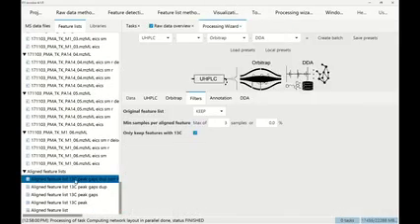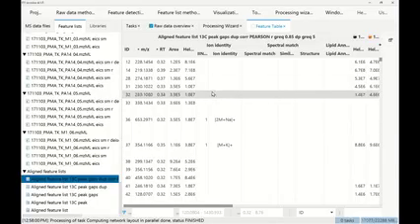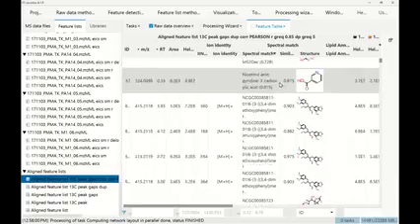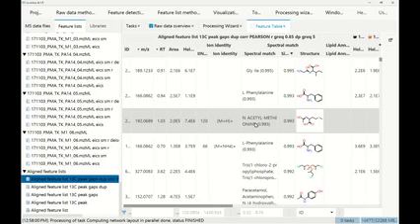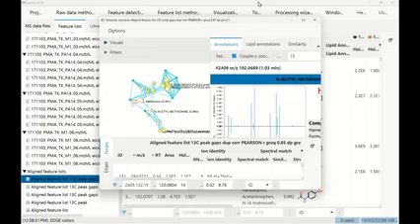I double-clicked on the feature list with the longest name. Then in here, you could, for example, search for your spectral library matches that you're very interested in, or the compound classes that you're interested in. And from here, you can then, for example, say N-acetylmethionine sounds interesting. You right-click, show, feature overview, ion identity molecular networks, just anywhere on the row.